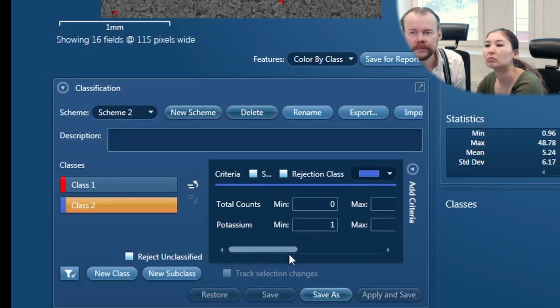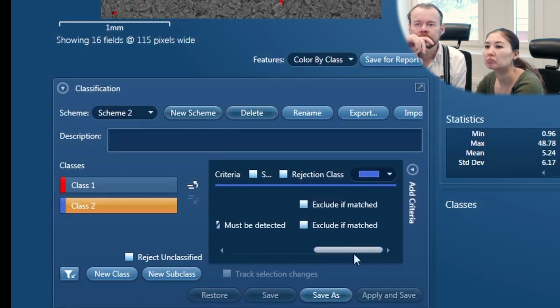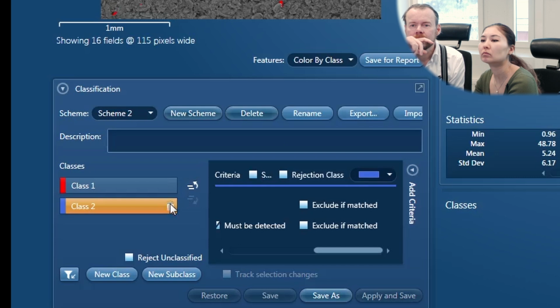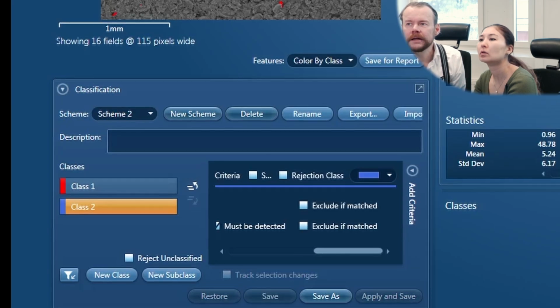Yeah, but the maximum must be 100. I thought I did. Oh yeah, you did that. But they're still not classified. So what's the problem? Yeah, that's what I'm wondering. But okay, if we look at apparent concentration, the real is 0.16.